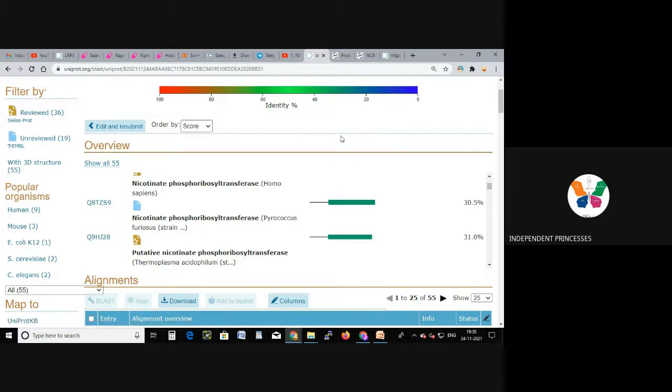In case we take Mycobacterium tuberculosis, the motif present in it can be compared to another organism using this. Yes, that's what we are going to do here.